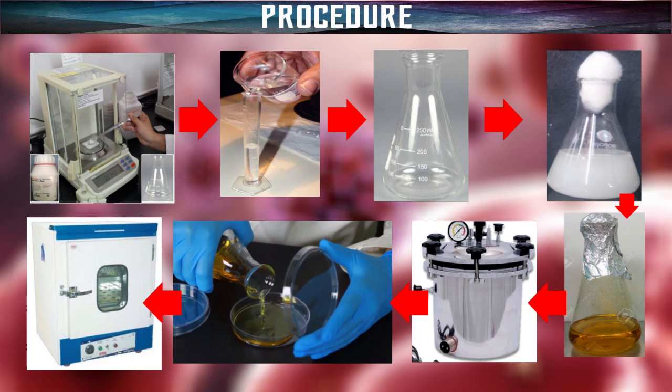After 15 minutes, allow the autoclave to cool down to room temperature and then gently remove the conical flask containing the media.